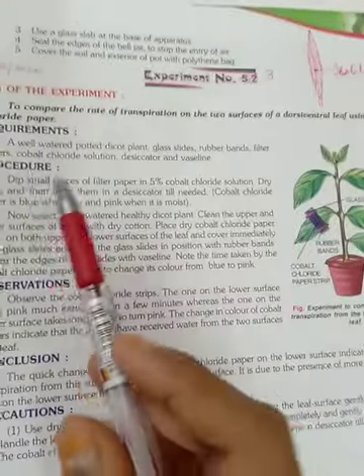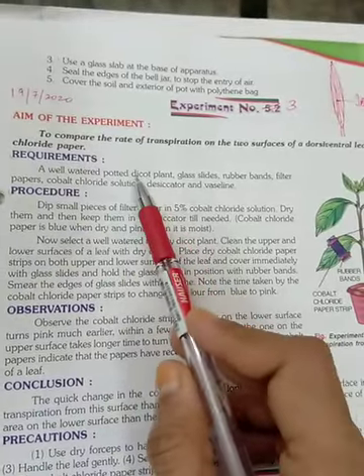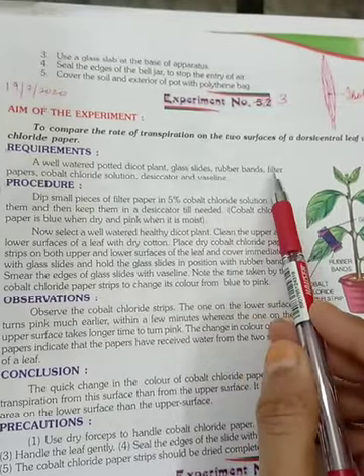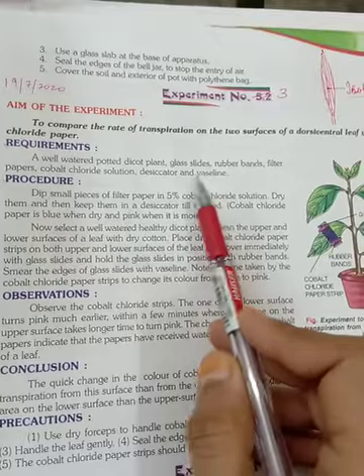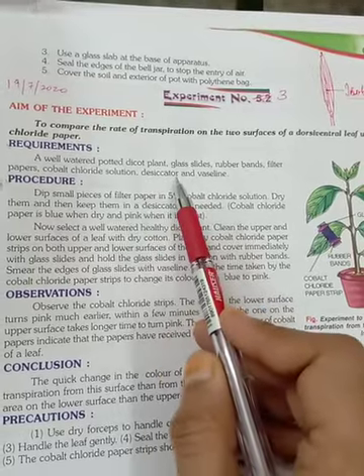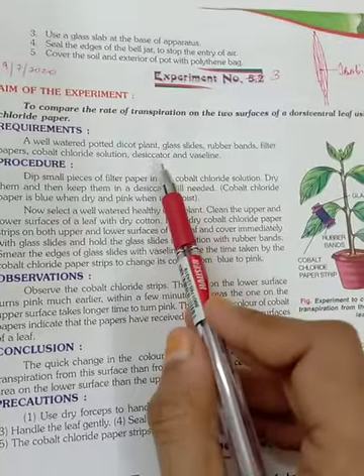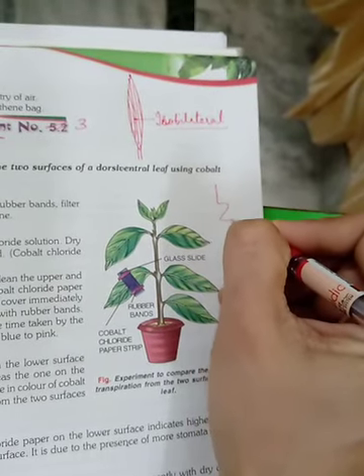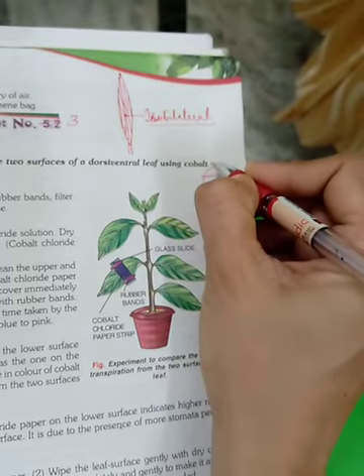So let us see the requirements of the experiment: a well-watered potted plant, obviously a dicot plant, glass slides, rubber bands, filter papers, cobalt chloride solution, desiccator, and Vaseline. A desiccator, children, is a device used in laboratories to keep any object away from moisture. It is made of glass, with a conical base and a lid at the top.